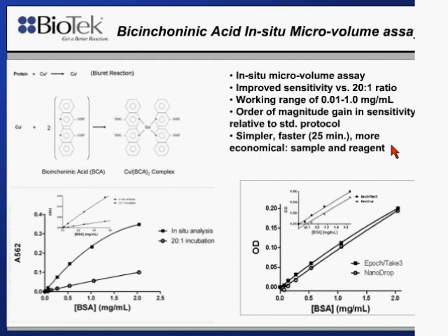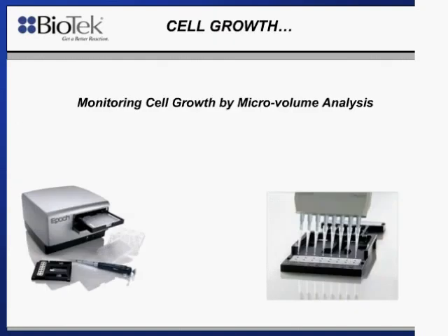Lastly, as I mentioned, I'd like to discuss some monitoring of cell growth in a microvolume format. Again, the value here is that if you're doing screening of multiple cultures or multiple clones, you can do it in a much smaller volume. Again, we're going to be working at 2 microliters here.